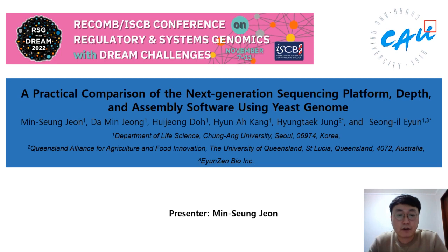Our research, a practical comparison of the next generation sequencing platform, depth, and assembly software using yeast genome, analyzed the optimal assembly pipeline in de novo assembly by benchmarking 4 sequencing platforms, 6 sequencing depths, and 6 assembly programs.